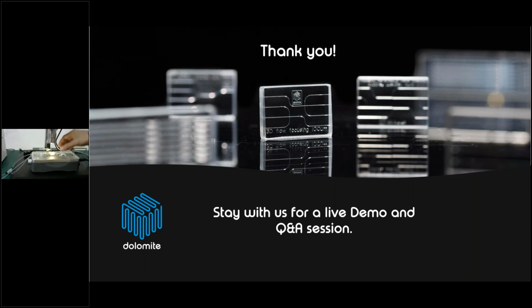The chip can be connected with the tubing by using a connector and an interface. We call it an interface. With the interface in here, you can see, the chip we design has a side that can fit with the interface, and it's very easy to connect with the tubing using the linear connector.